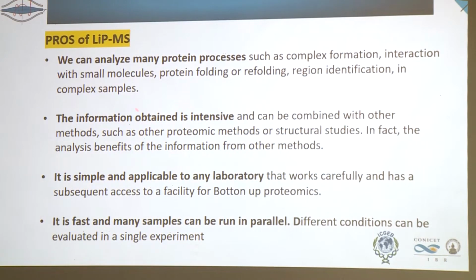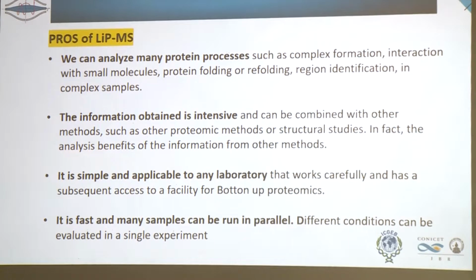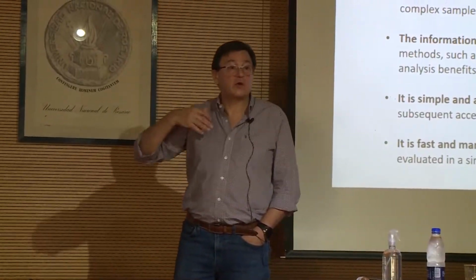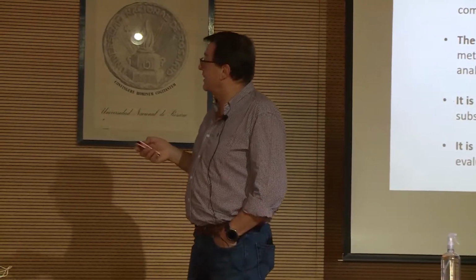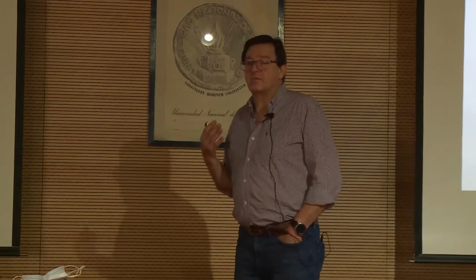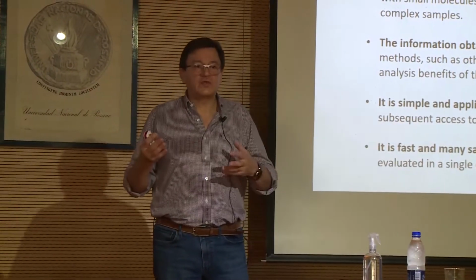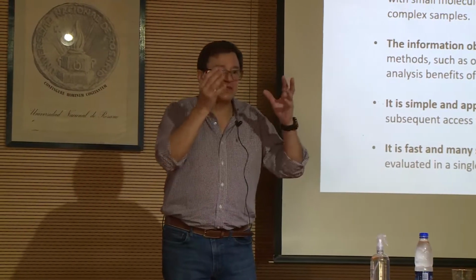The information obtained is intensive. You have a lot of information. So it's a good idea to combine with other proteomic methods, maybe from your lab or from other labs, and compare the information. And sometimes with structural methods, it's not a bad idea to see whichever you use and say, well, this is the structure of this protein.